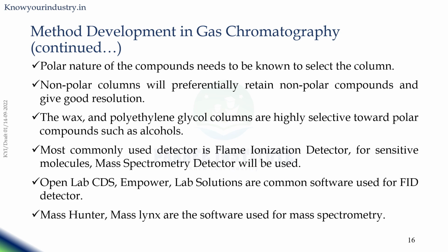During method development, we should understand the nature of the compounds. The polar nature of the compounds needs to be known to select the column for the particular method. Non-polar columns will preferentially retain non-polar compounds and give good resolution. The wax and polyethylene glycol columns are highly selective toward polar compounds such as alcohols.